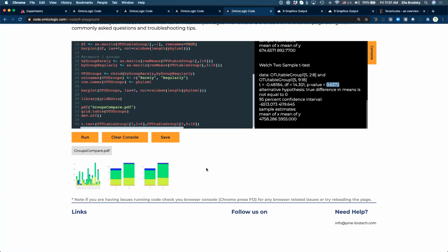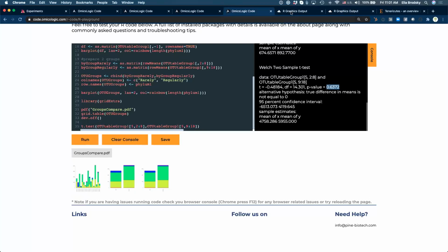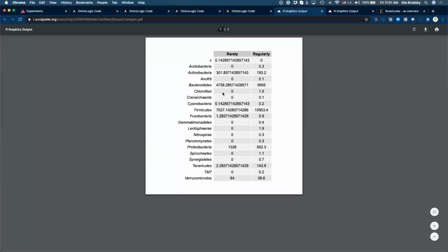Okay, so I just wanted to briefly introduce you to how we can use some of these things and study differences between groups, making sure that we're also thinking about how this is going to be useful for biological interpretation, right? So it's nice to have an output like this to see what some of the differences are, but we still have to check for variability, and that does play a big role.